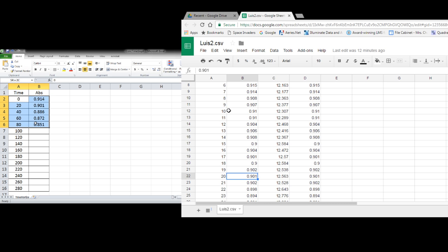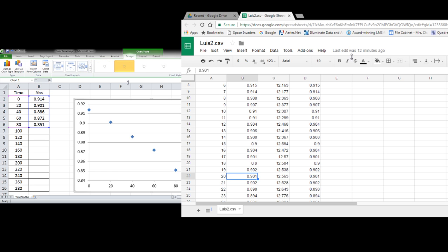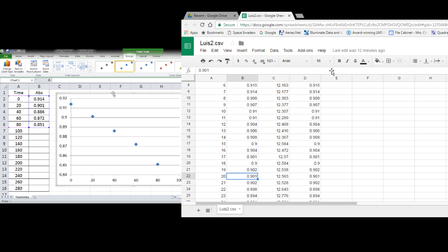And what I'm going to do is highlight that portion and we're going to go to insert up at the top here. We're going to click on scatter graph.